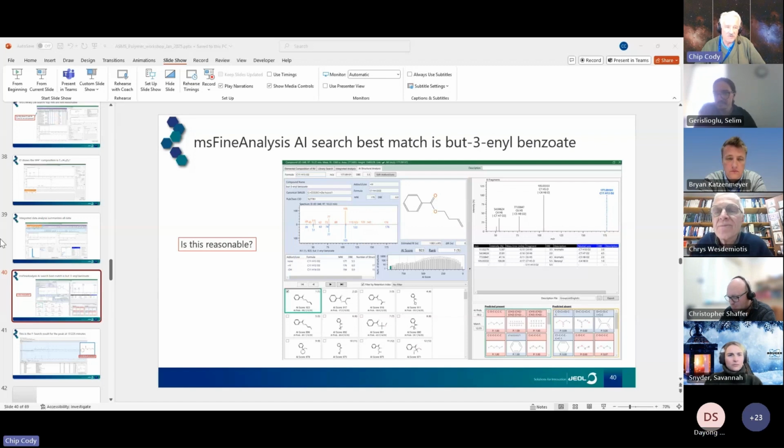It can. Originally when they introduced it, they were limiting it to JEOL systems, but they've opened it up. In fact, I think Chris has a copy. It's open to any type of instrument data. I've just imported text spectra, XY pairs, for example.